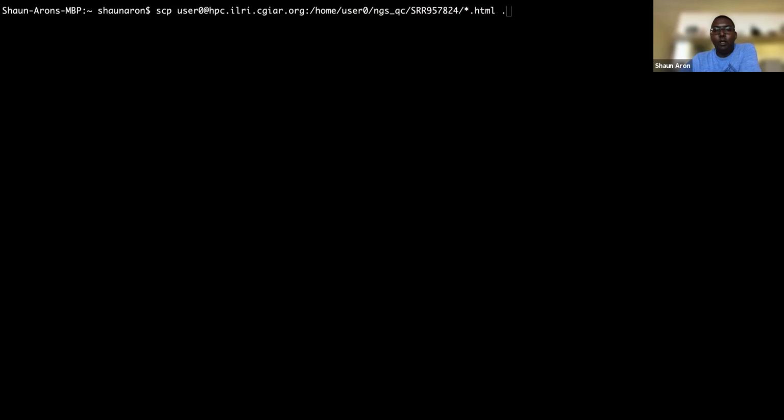So Jeremy, I think it's 0.11.7. Take out the one, I think. Just go module load fastqc. Yeah, so it's 0.11.7, yes. Just remove the one. Thanks, Margaret.